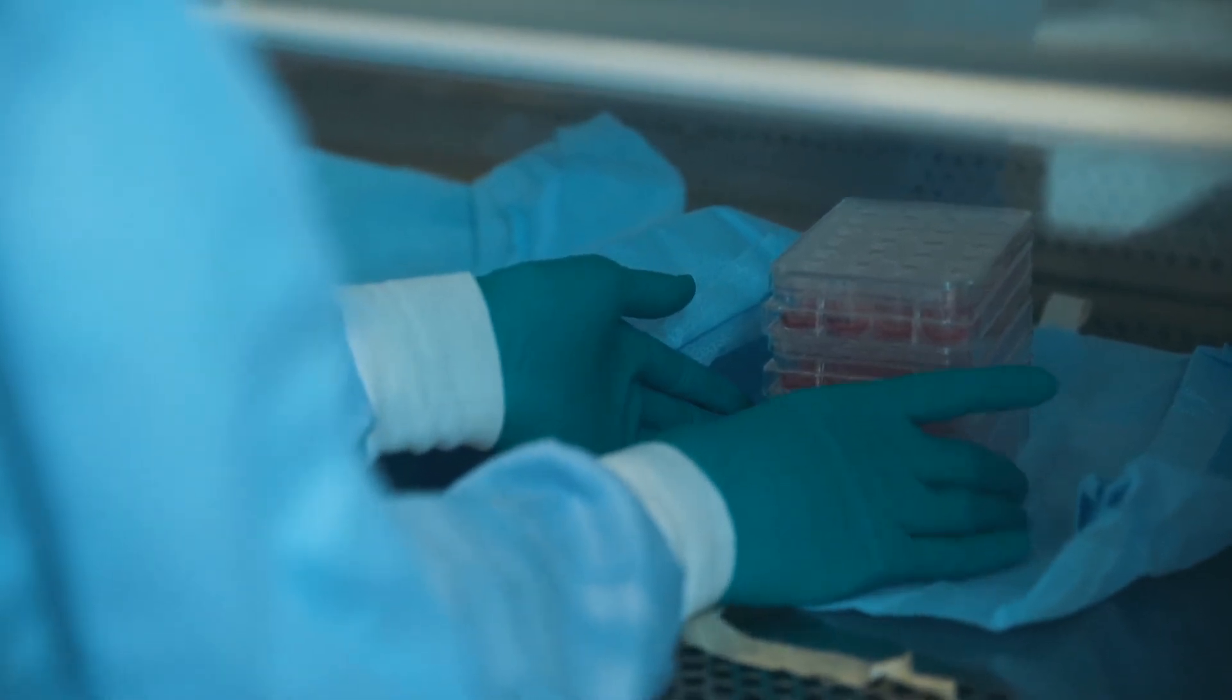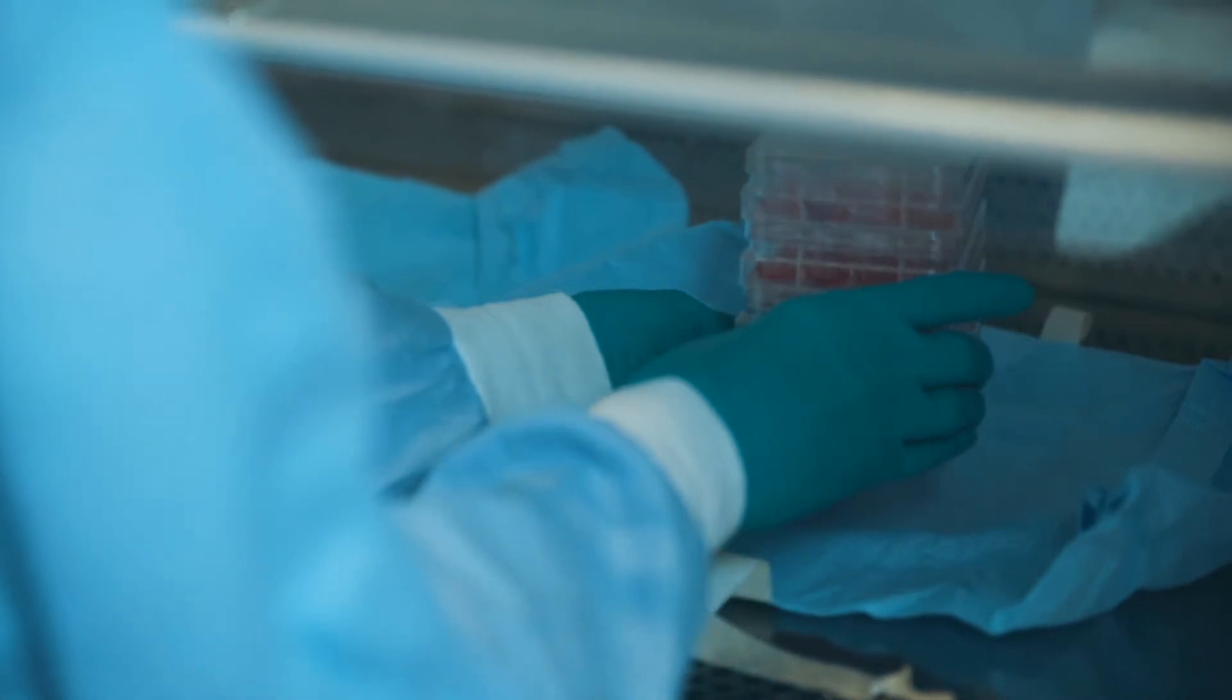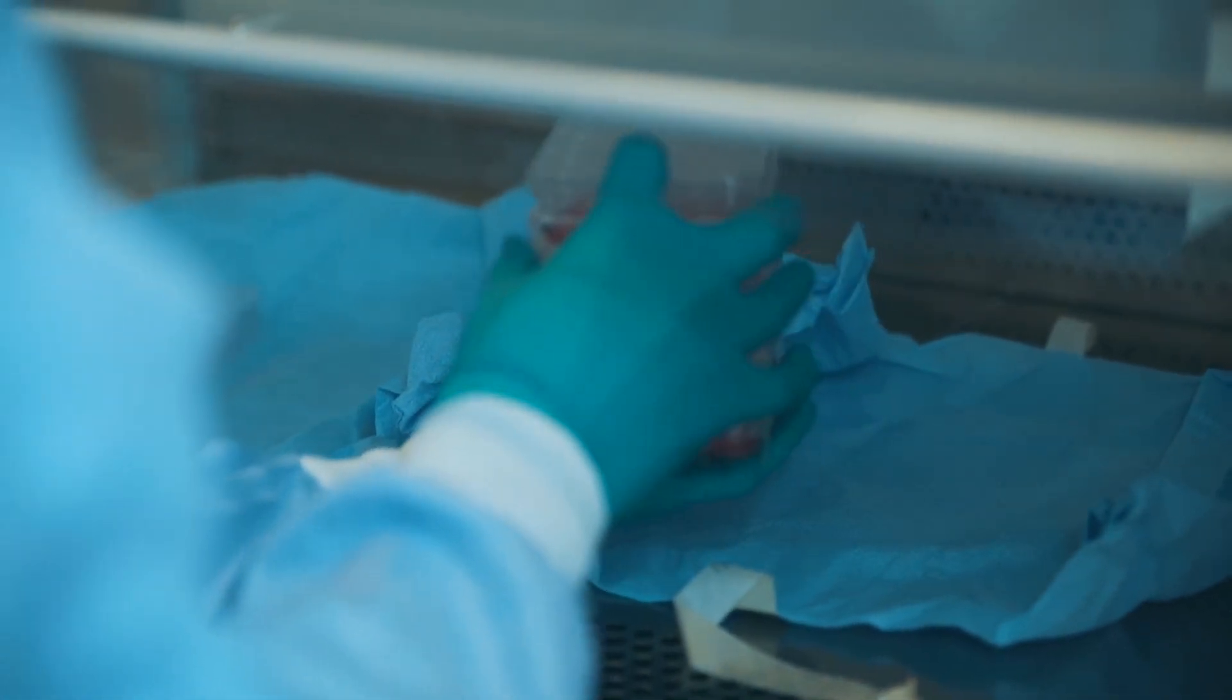The process of cell culturing can take months to complete. It is important to keep your cells free from contamination to ensure precious time and effort is not wasted.